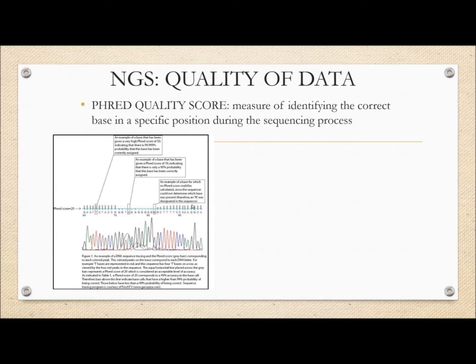So for example, if you look at the picture and a base doesn't fluoresce, and you expect something to be there, but you see an empty space at that particular slice in the fluorescence pictures that you're taking, then it'll be assigned as an N. Okay, so this is an N. That means it's a no score.